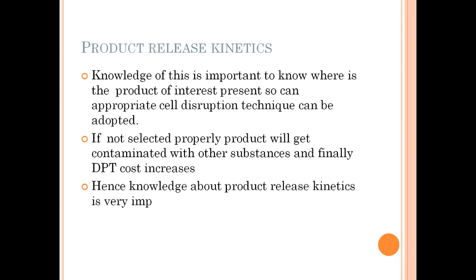So to avoid these issues, product release kinetic studies are very essential, and once you know that, you can try to release your products or extract your products from the system within that particular time, so that you can reduce your DPT cost finally.